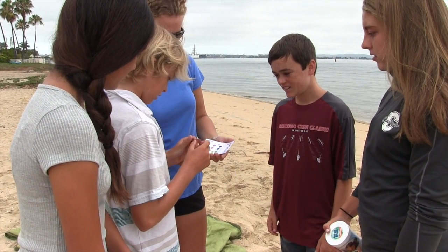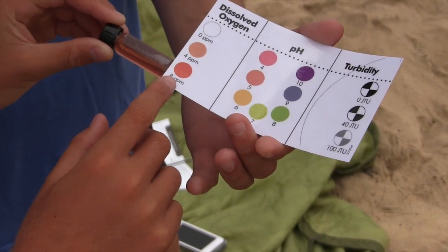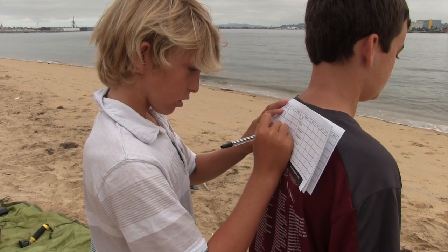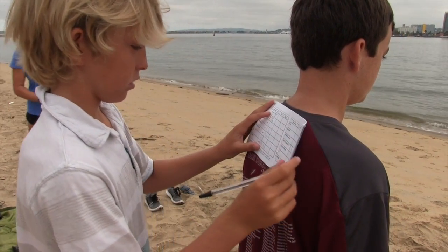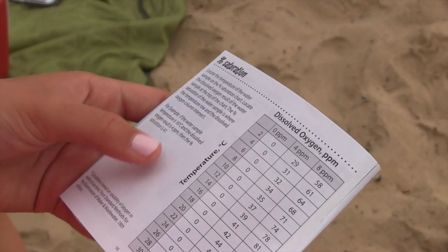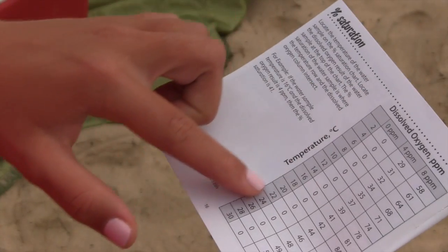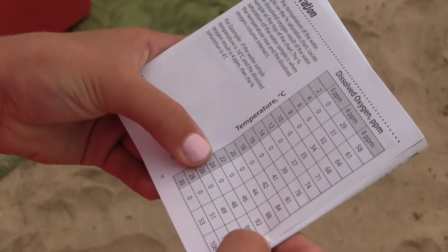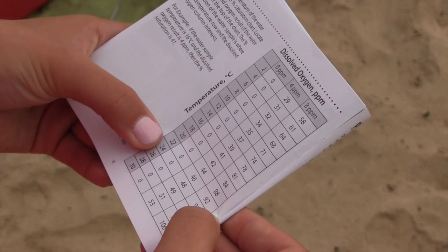Next, wait 5 minutes for the color to develop. Now compare the color of the sample to the dissolved oxygen color chart. Record the results as parts per million. Now we can find the percent saturation by using the chart in your information booklet. Locate the temperature of the water sample on the percent saturation chart and the dissolved oxygen result. Find the intersection of the two. This is the percent saturation.